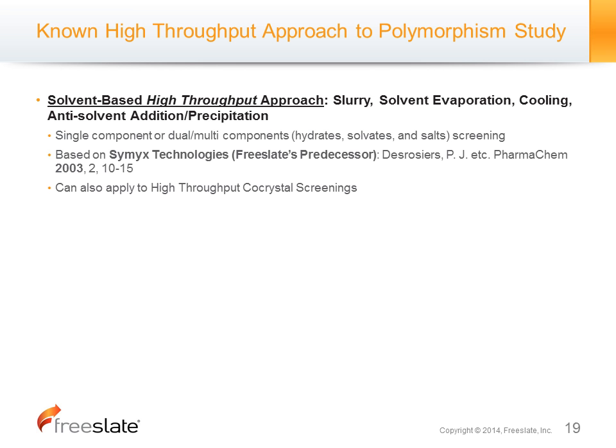And this is from Symyx Technology, which is Freeslate's predecessor. In 2003 they published this, and we still use the technology today within our group to do high throughput screening: salt screening, polymorph screening, single component, or even co-crystal screening now.